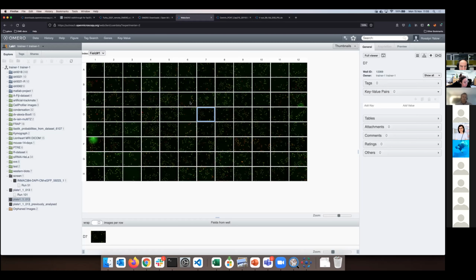Are the group tabs generated by the system administrator? Indeed, they are. Manager, or can users or group leaders? No, they cannot. So the system administrator in Omero, I would imagine Joanna, for example, would have rights to create a new user and new group.